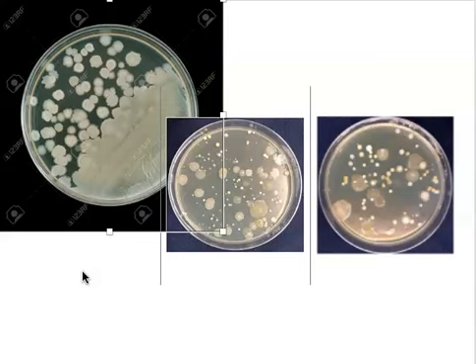You cannot tell the difference between a bacterium and a fungus on an agar plate. Even though sometimes we look at certain colonies and we think, gosh, that looks really fuzzy, and that makes me think of fungus, you cannot know that that's a fungus until you look at it under the microscope.